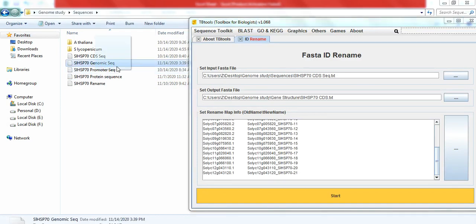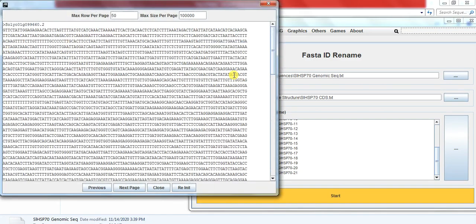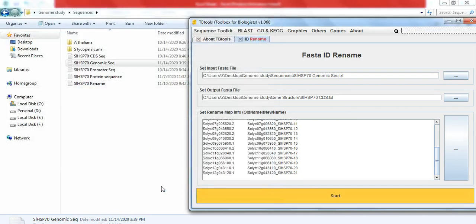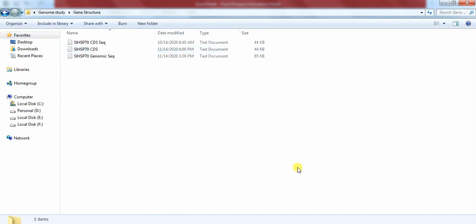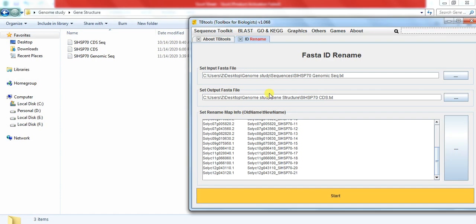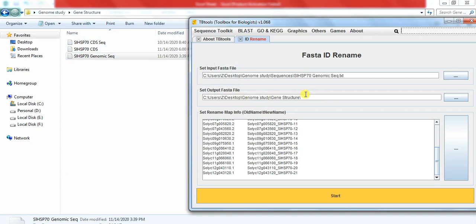Then again go to the sequence folder and drag the genomic sequence. Put the name and here write the name Solanum lycopersicum HSP70 geno.txt, and also these all contain that ID name, and start.